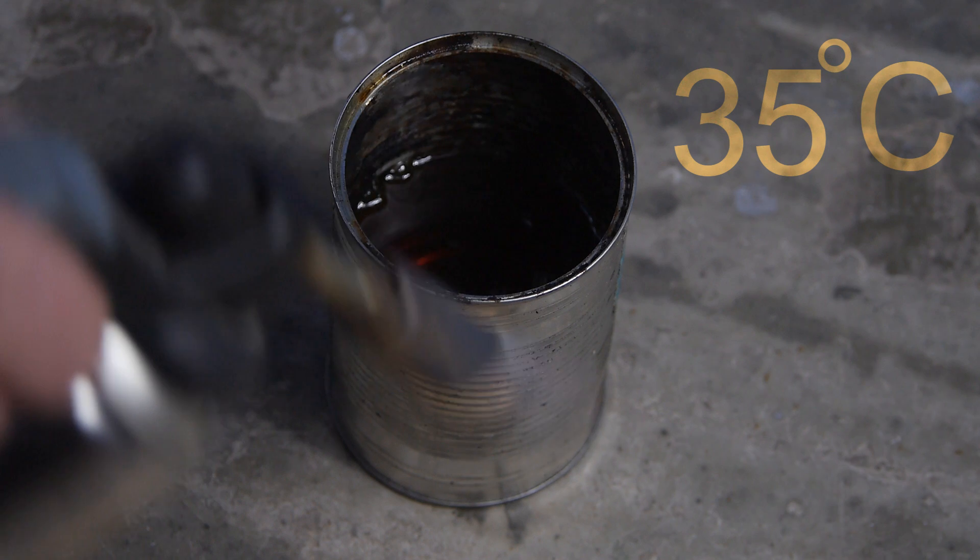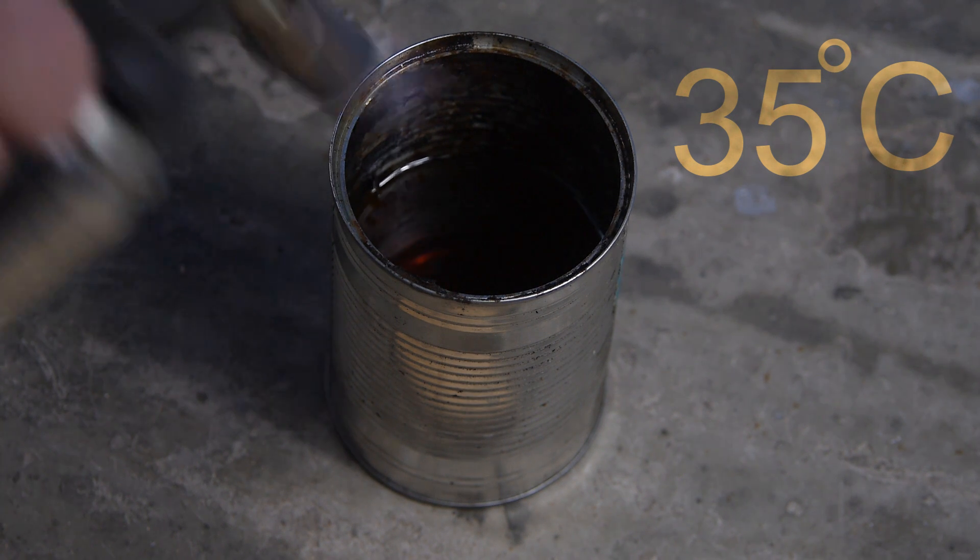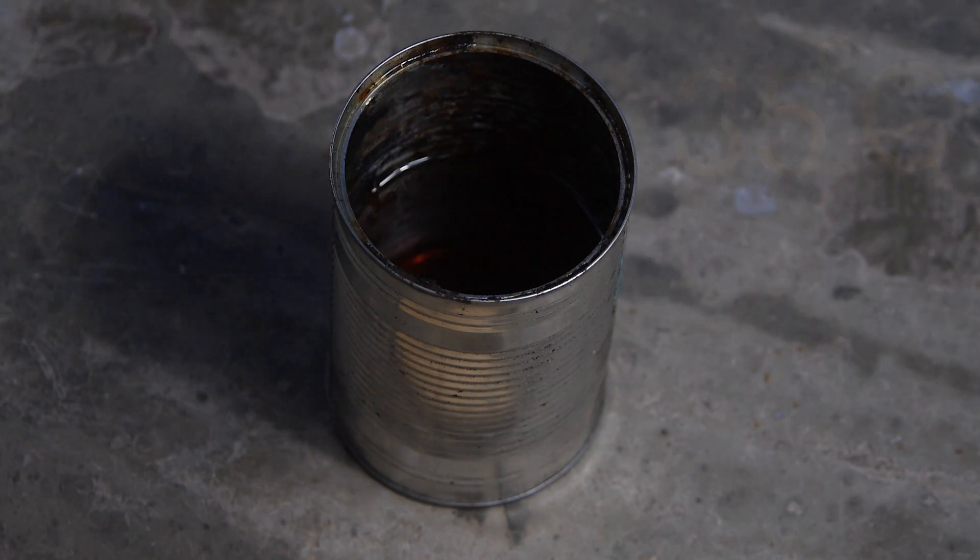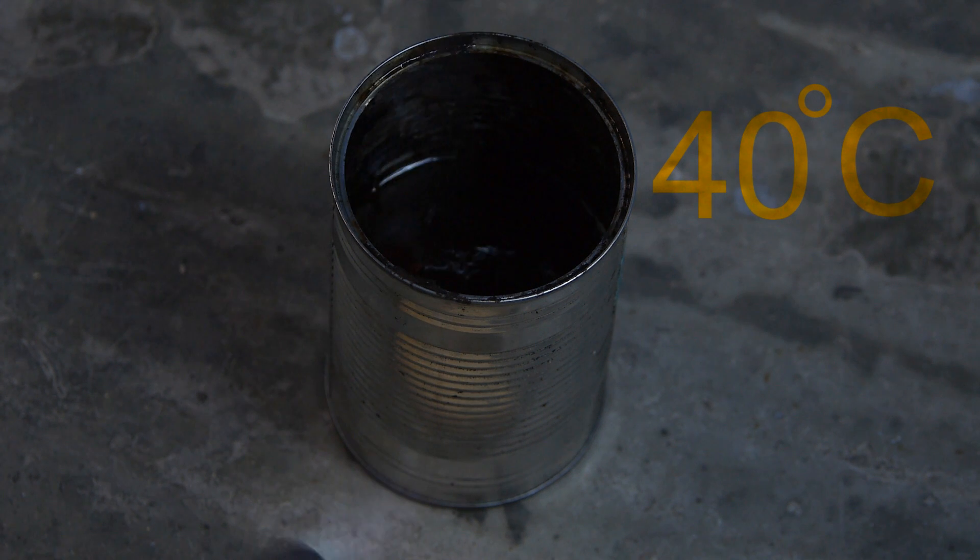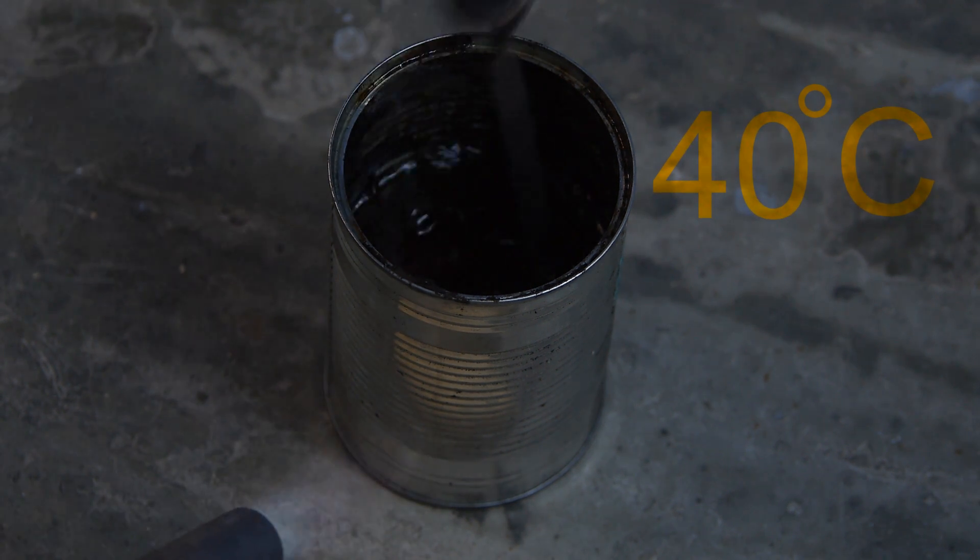Now, as you can see, there was a flicker of flame this time. It can't sustain a flame, but it does try to flash. So now we're going to 40 degrees. 40 degrees centigrade should be the flashpoint of kerosene.